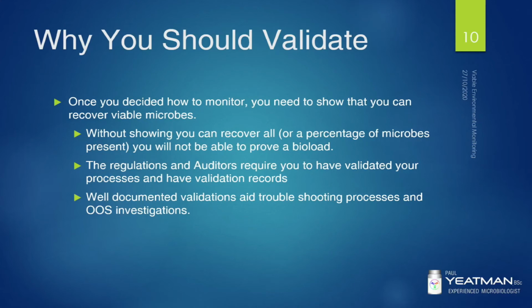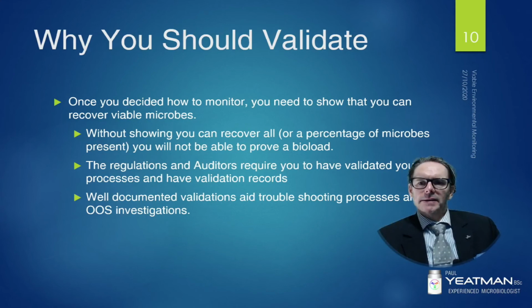For a production facility that has been running for years, sampling using swabs or contact plates may have been introduced before validation was mandated by the regulators. This may mean that such sampling techniques may have been grandfathered. The recovery of microbes with years of data can be shown to indicate an issue, and the no recovery could be shown to represent minimal risk to the batches manufactured despite recovery levels being unknown.